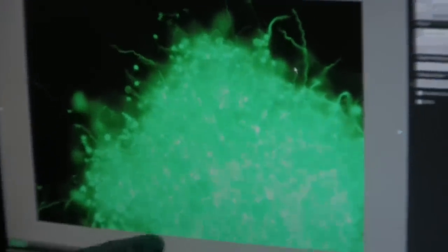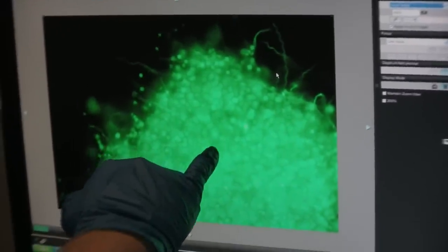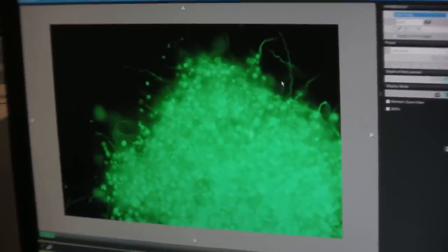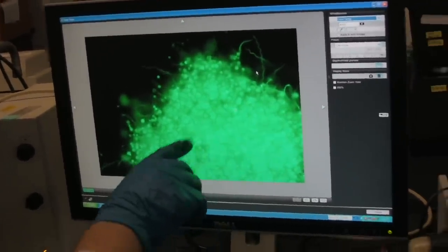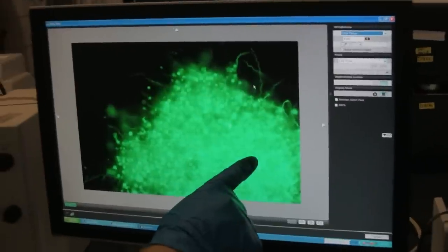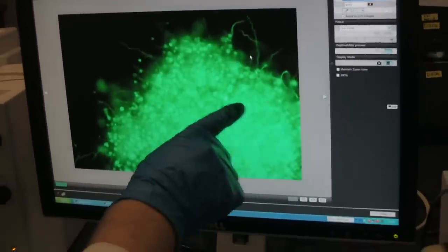And this is a biofilm, like I showed with a dark field. And here, with the fluorescence, we can actually see down into the biofilm much more so than we could with dark field. And you'll see that these bright spots are actually positions that are fluorescing the protein, which means that they're part of the Borrelia body. So you can see in the composition here, there are spirochetes inside the biofilm. And there are also a great number of cyst bodies. You see all of the spheres that are here.